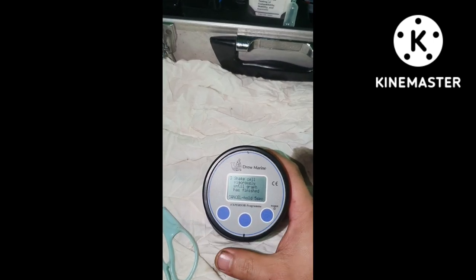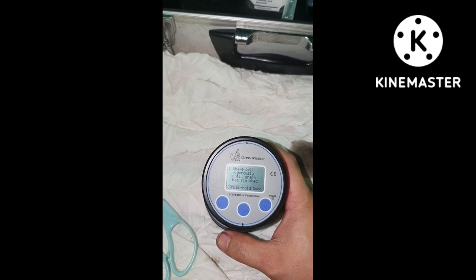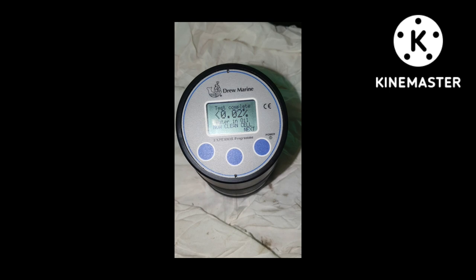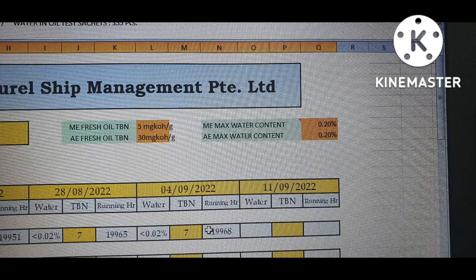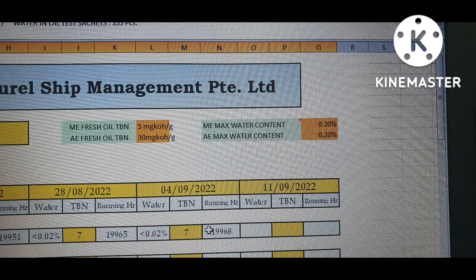Press next and wait for 5 seconds, then shake it vigorously. After 180 seconds, we got less than 0.02% of water content in our oil. Based on our sheet, the maximum water content should not be more than 0.20% of water. It means we passed the qualification for our generator system oil.